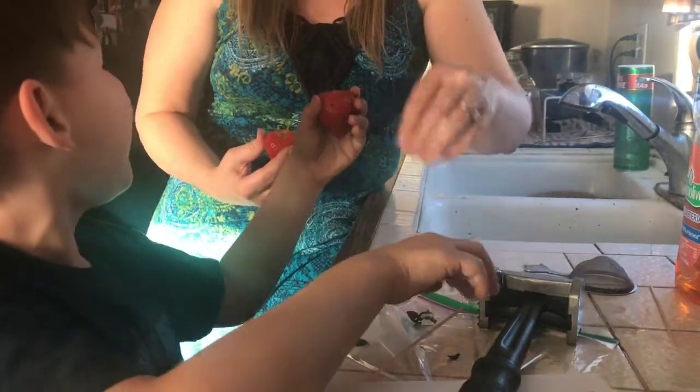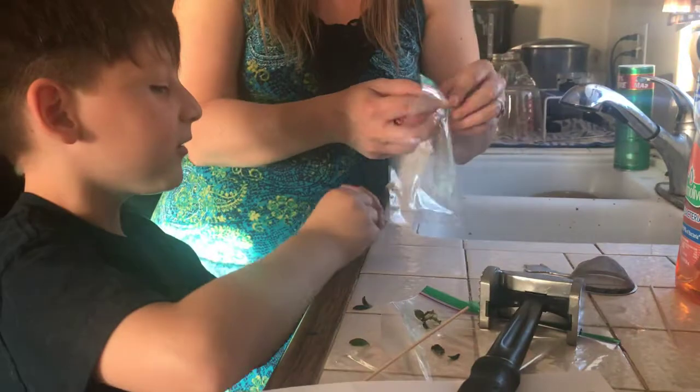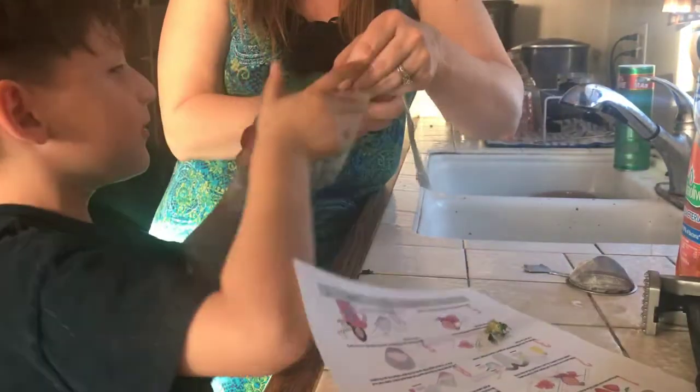I took the whole part out! Perfect. Now put your strawberry in your plastic bag.